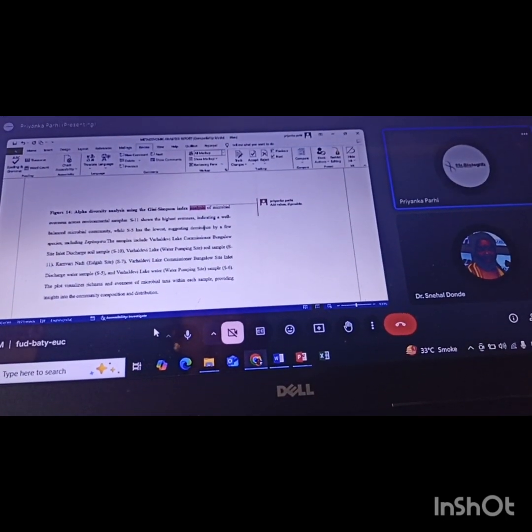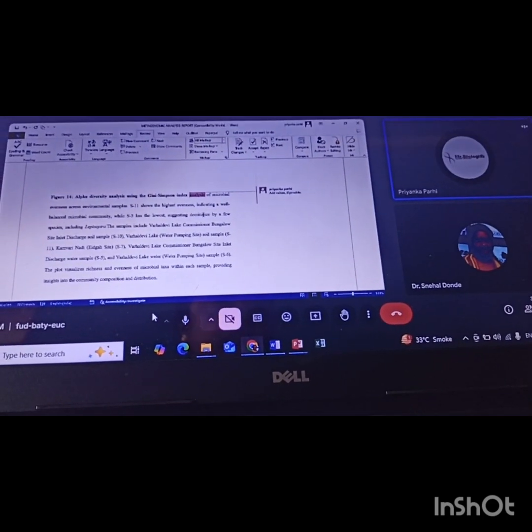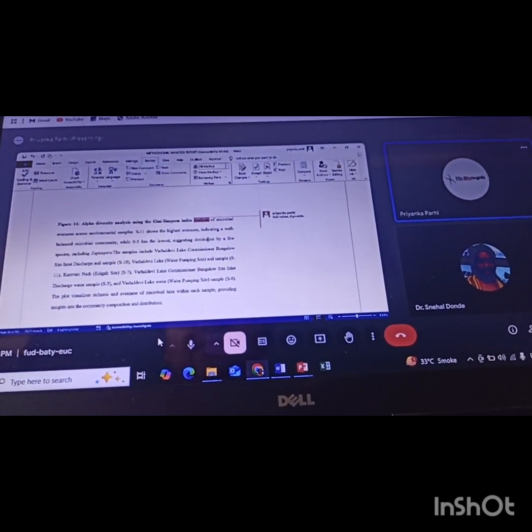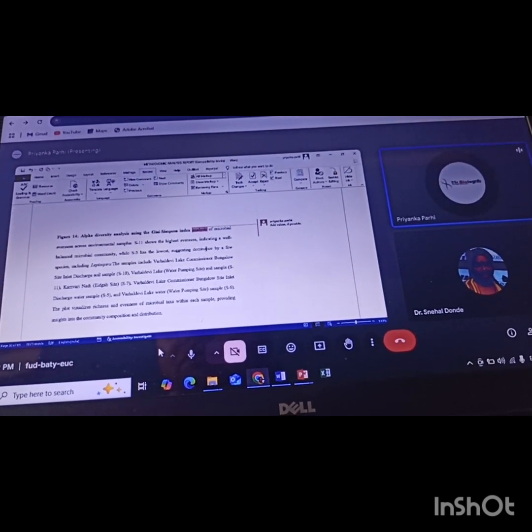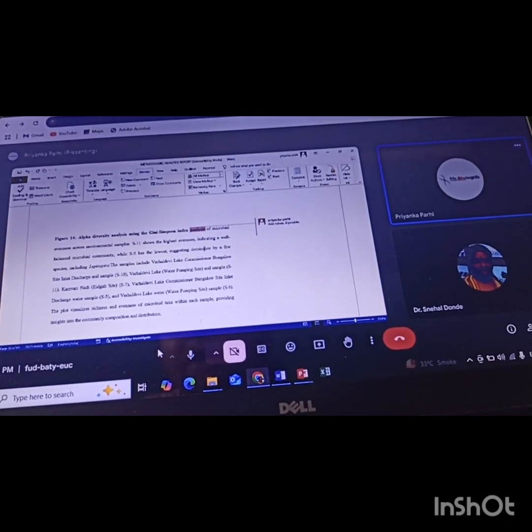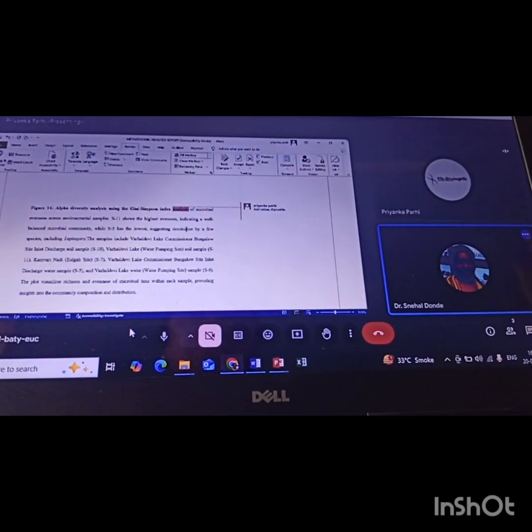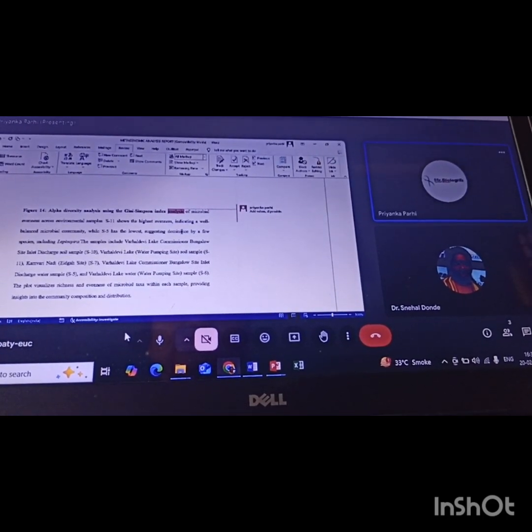What is the software which gives us this? It's QIIME, which uses Java and R. In the report it's written, it's a software or a platform, QIIME. And the programming language is Java or R. Okay.